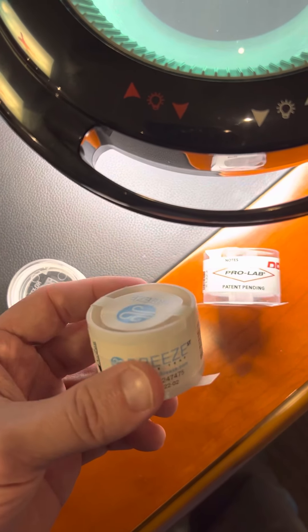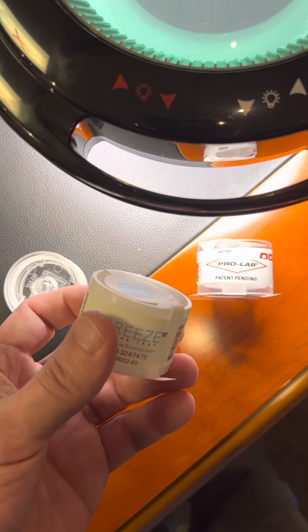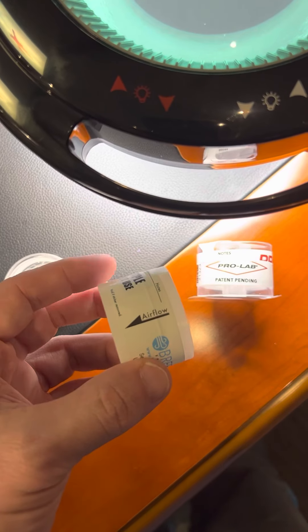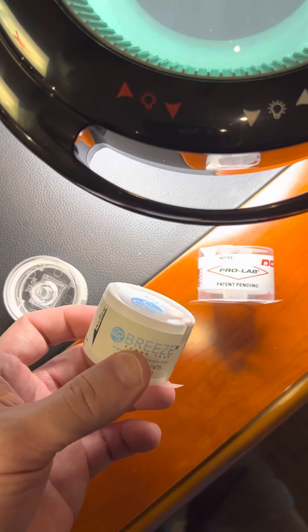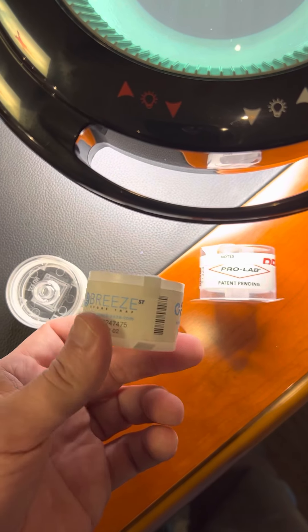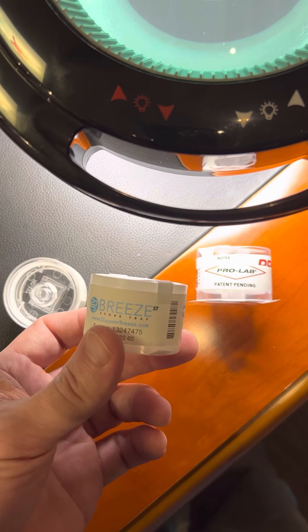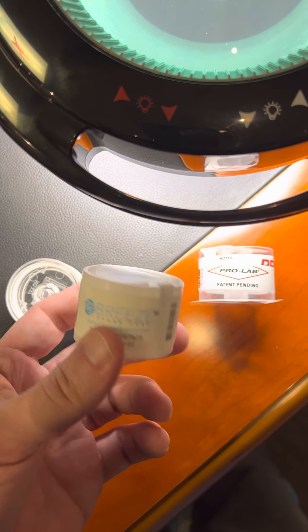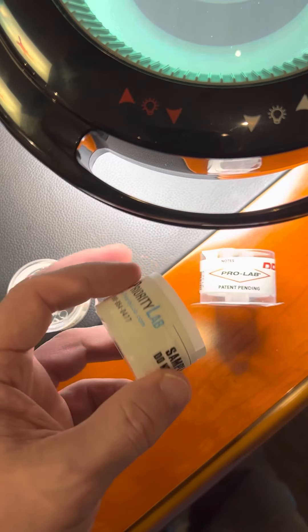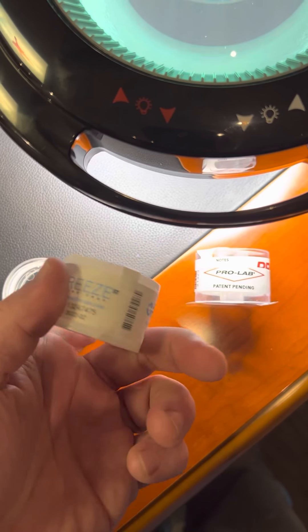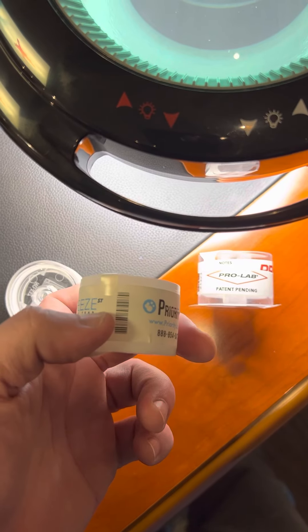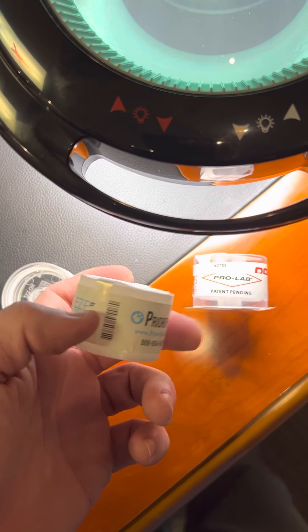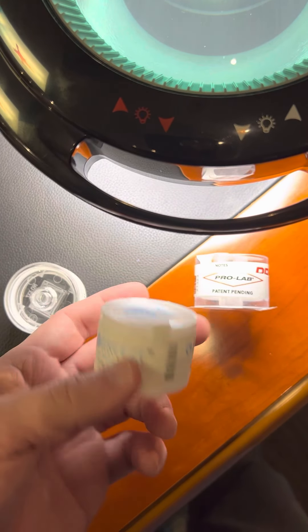You'll notice they're exactly the same in size. They're actually very similarly built. However, there is a patented process on the plastics. It's a more secure application. It cannot be tampered with and also makes certain that your lab results are more credible.